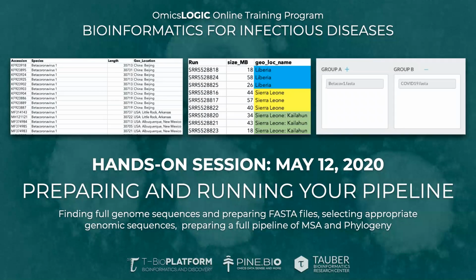As you can see, we're moving pretty fast, and our goal is to get to a research result, not figuring out how to make your computer work with a certain program, which is typically a very time-consuming task. The other issue here is that some of these files are huge. We'll be dealing here with files that are many gigabytes in size per sample, and we'll take many samples together. We'll do something like 20 and 50 samples. So these pipelines will generate a lot of data, and I'm not sure that everybody, I, for example, don't have that much space on my laptop. So unfortunately, that's just not feasible.